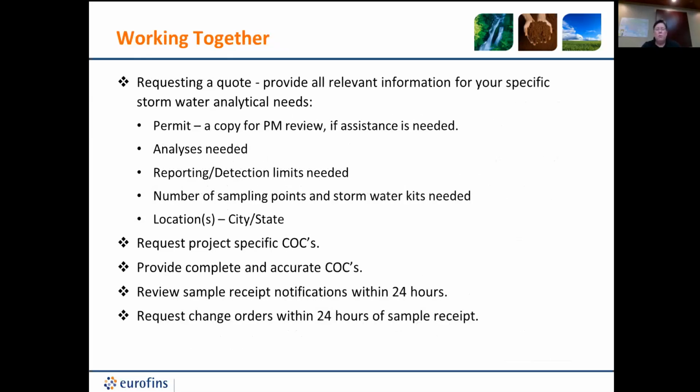We want to make sure that you guys are requesting a quote up front so we know what's happening, that we review your permit if need be, so we understand the analyses and whether or not we can meet your reporting and detection limits, that we understand how many sampling points and kits you're going to need, and where you're collecting. I mean, we get stuff literally from all over the state that's shipped into us via FedEx and UPS. It is helpful if you do request project-specific COCs.